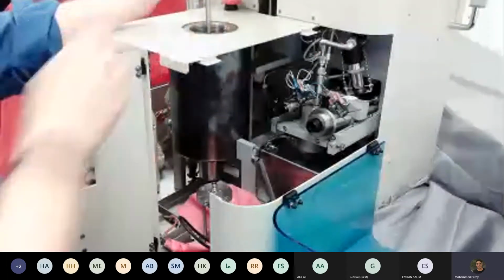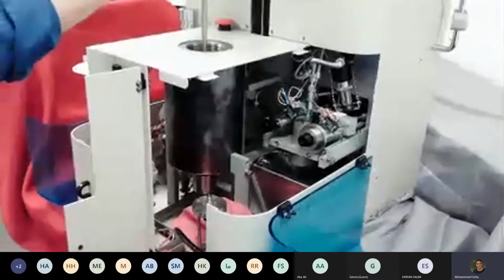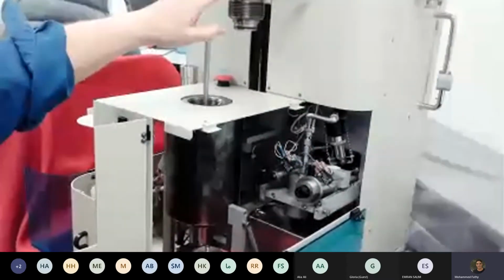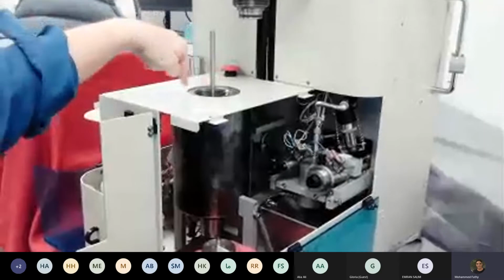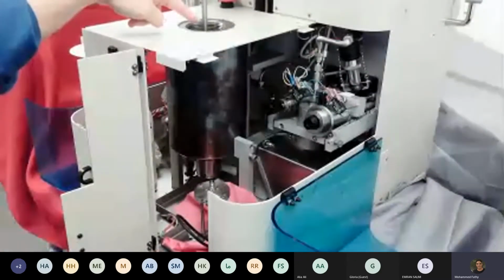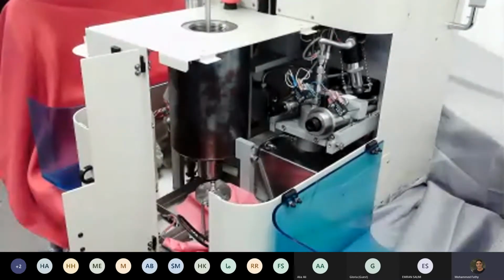Okay, and then this, let me just see if I can raise that up for you. This, we call it a high pressure sealing plug, is going to come down and screw into the high pressure cavity and seal that up. So that seal is good for up to 60,000 psi.